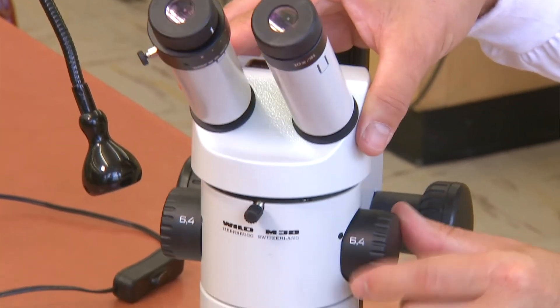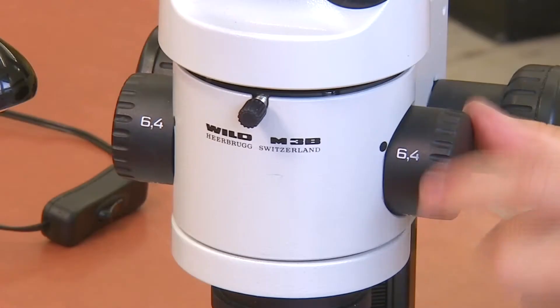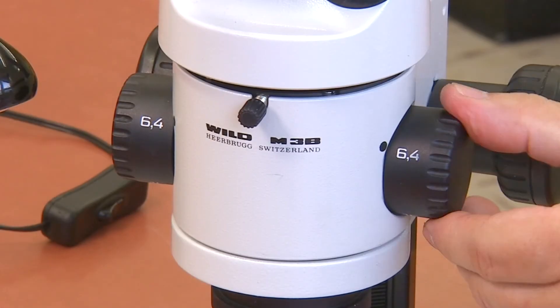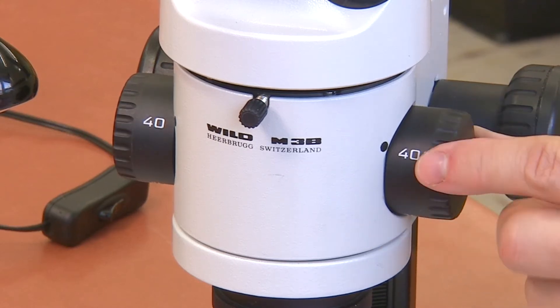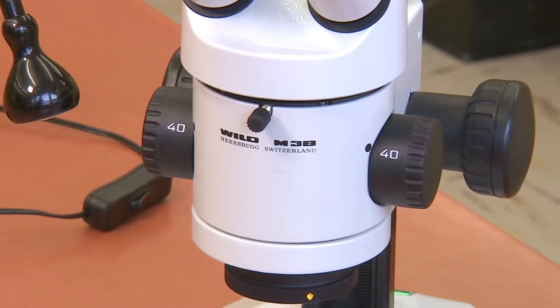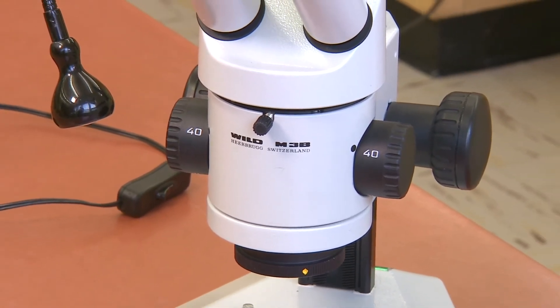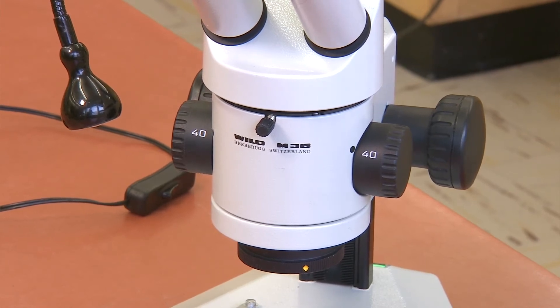Below the oculars is the objective lens adjustment knob. This can be rotated to change objective lenses. Your dissecting scope has three objectives which give 6.4 times, 16 times, and 40 times total magnification. Notice that the highest magnification on this microscope is about the same as the lowest magnification on the compound microscopes we use.